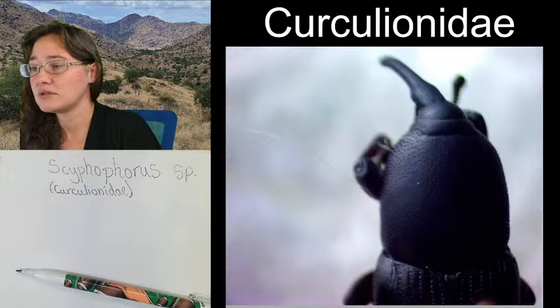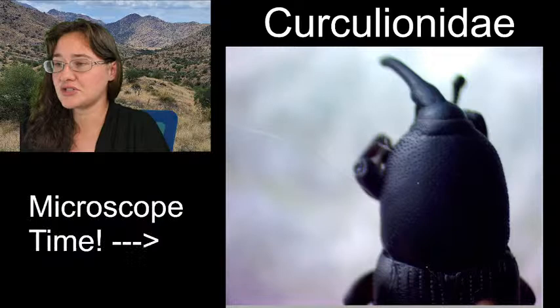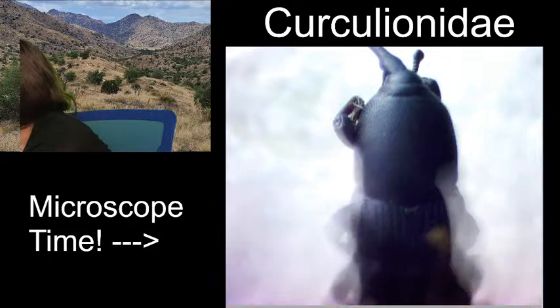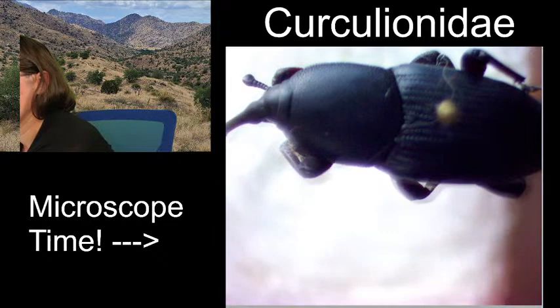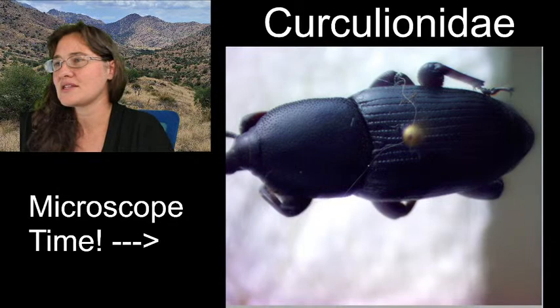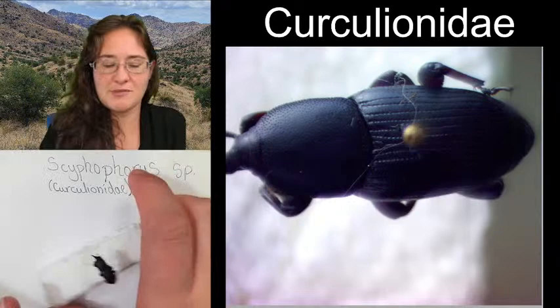I'm going to go ahead and turn off my USB camera for a minute so that we can move our specimen around. I want to see if I can get it all in frame. I thought that there might be a chance. Maybe if I turned it this way. But I'm just not going to be able to get the whole specimen underneath our microscope. So what I'm going to do is leave that there and pull my specimen over here so that I can measure it.